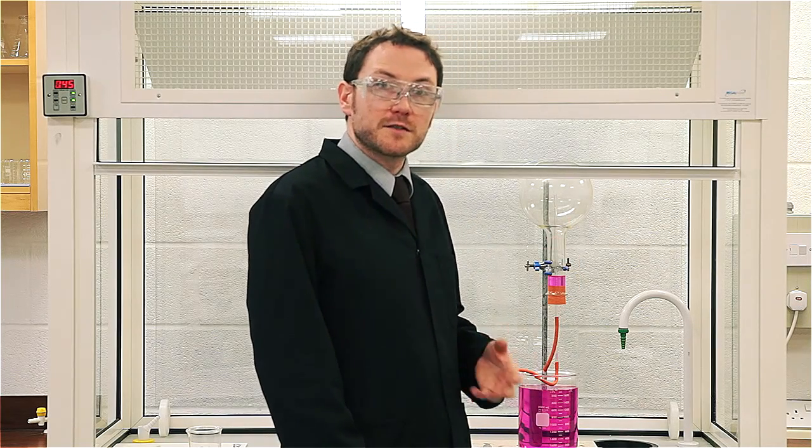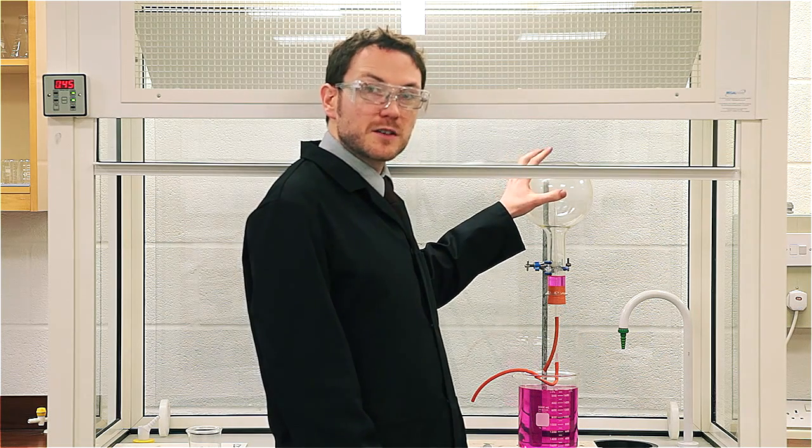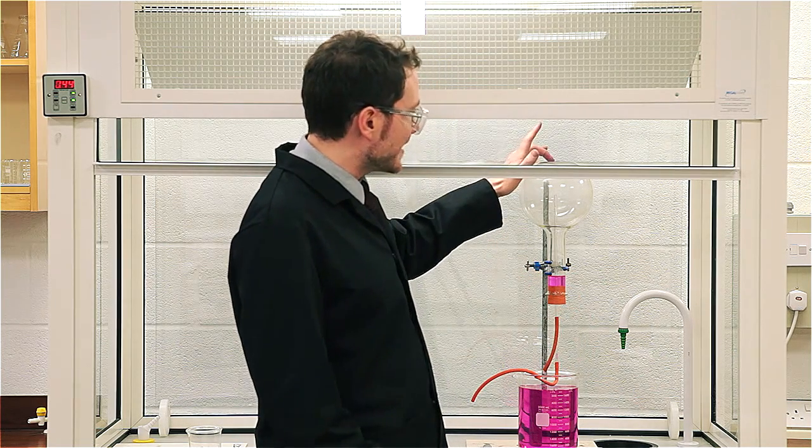You'll notice that I've drained the flask because it was quite top heavy. But this alkaline condition that we form in the top flask is actually really beneficial to our luminol reaction. Instead of drawing up liquid from one flask, we can draw up from two and allow them to react inside the jet.